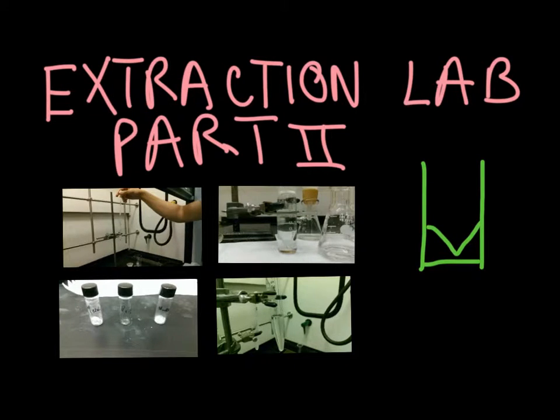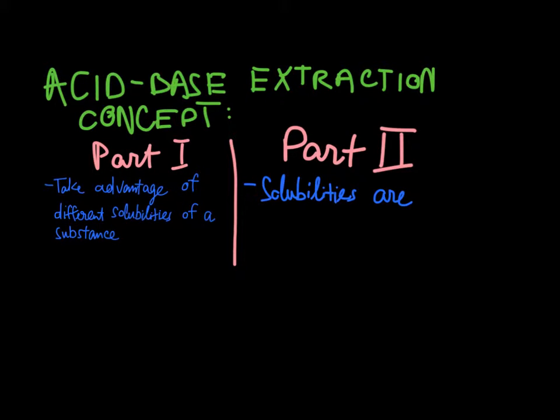Hello everyone. Today I will be talking about the experiment extraction part 2, which is the separation of acidic, basic, and neutral components in an unknown. In order to understand the acid and base extraction concept, we need to review the concept of experiment extraction part 1 a little bit.